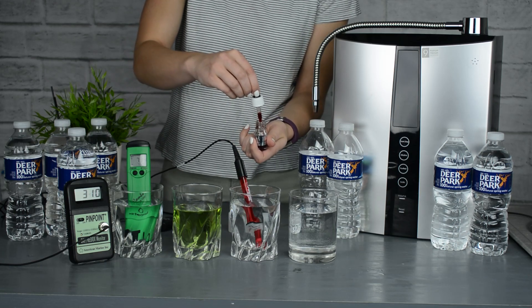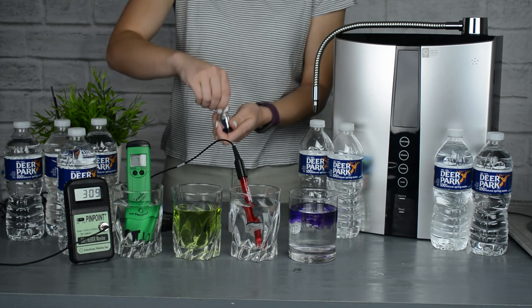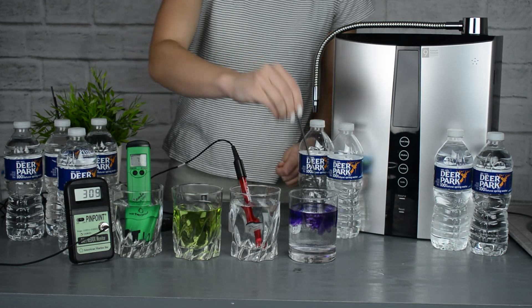Now in the alkaline glass on the far right, we put in some of the pH reagent drops and it quickly turns purple, which means that it is packed full of minerals.